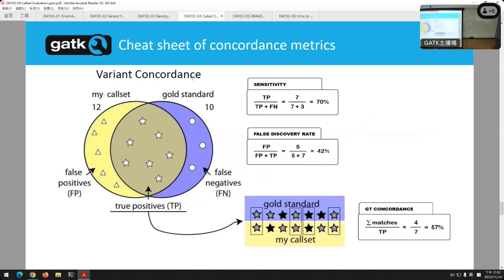And finally, it's not purely about the variants. You want to look at genotypes too, because seeing a variant is one thing. There's a difference between just site quality versus genotype quality. Sometimes it should be HOM, sometimes you call them het. We also have a genotype level concordance we can run too. This is what we were running just this morning. We're running the numbers against a couple of control samples, and you get good numbers out of it. You want to see high concordance with known truth sets. If so, you have a lot of confidence that you've done something good in your call set.